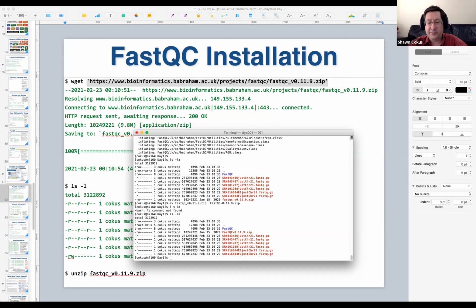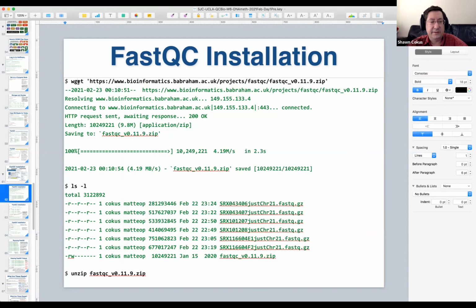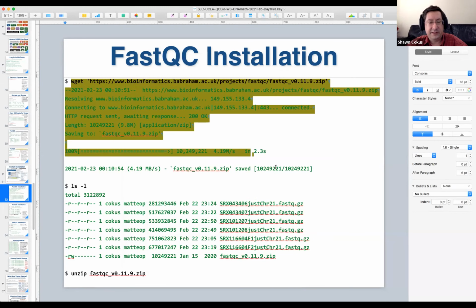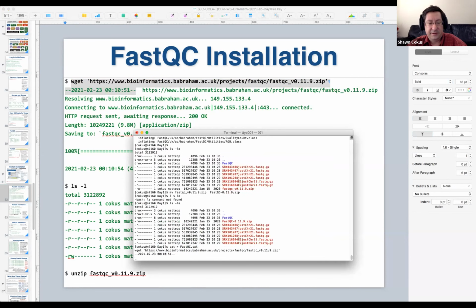Some people might also, for posterity, depending on how you keep your lab notes, put a little record there of the command and what date you retrieved it. You might even take this whole thing. Control D is EOF there. That will stop that.